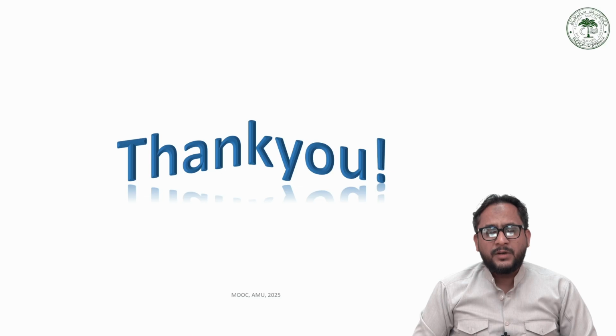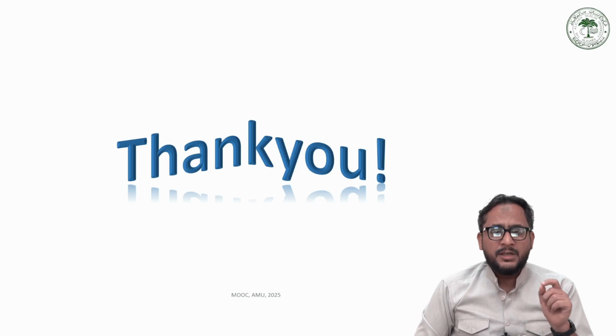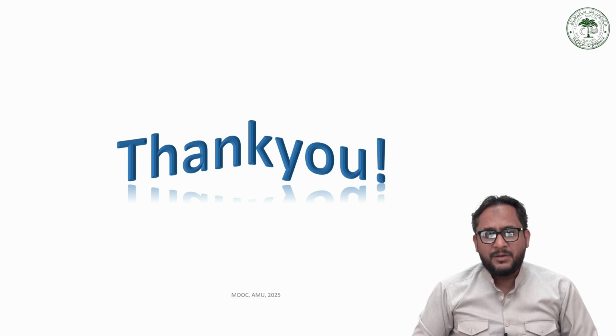With this, I am going to end this lecture. Thank you very much. So we have learned about the instrumentation of the spectrophotometer. In the next lecture, we will discuss the components, meaning the light source, what kind of light sources are used. Then we will discuss monochromators and also the detector. Thank you very much.